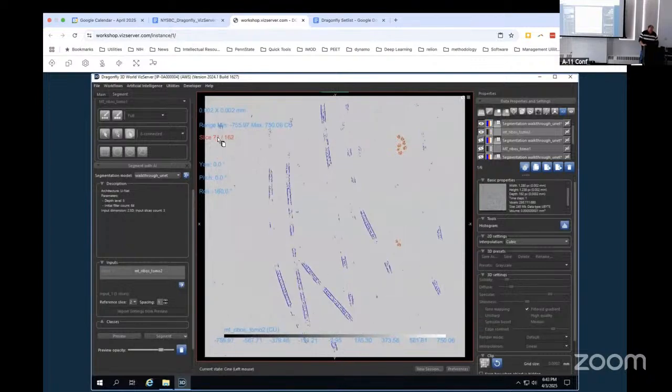Disclaimer. It's not easy to train with multiple inputs, right? Because when we get done with this, we're going to retrain with our new inputs from here that we hand corrected. And we're going to give it our old training data so that it sees both. But the original training data had ribosomes, microtubules, and background.